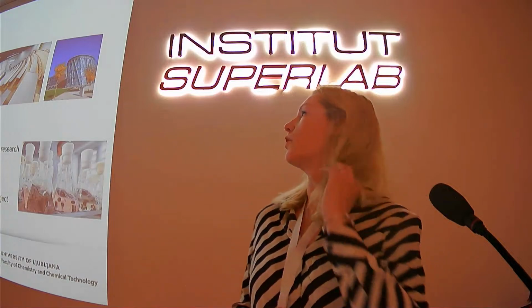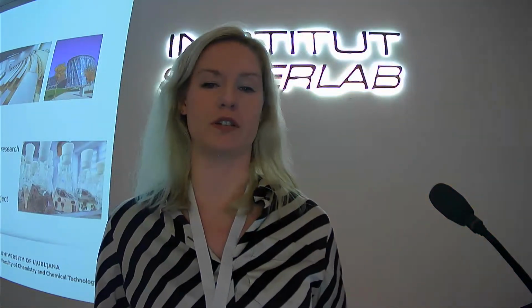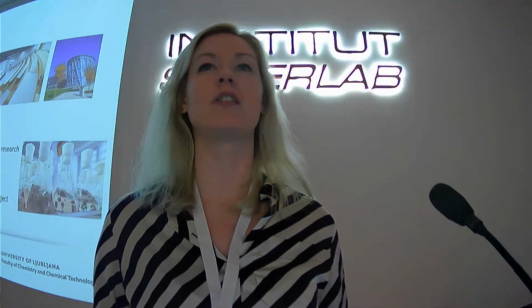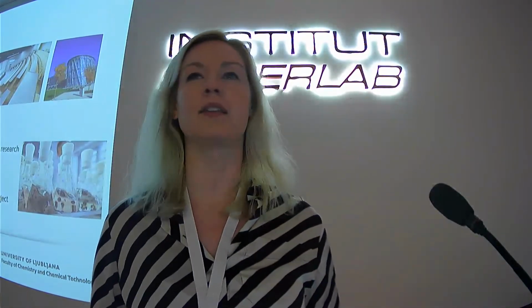So yeah, today I will talk about how to prepare environmentally relevant microplastics for laboratory research. This was one of our first things that we did with our research team, Planterastic, when we started to work with microplastics more than 10 years ago. We also have material scientists at our faculty.